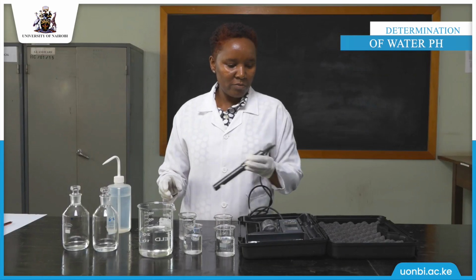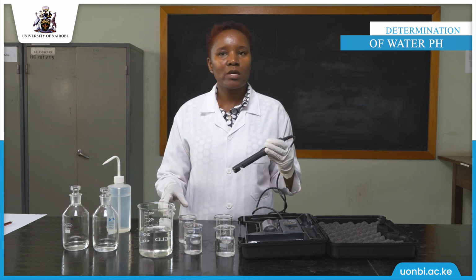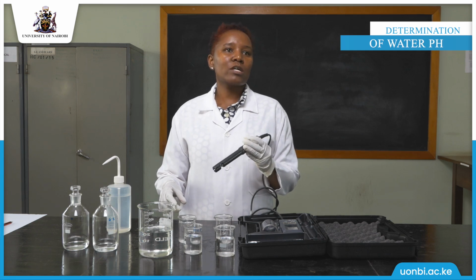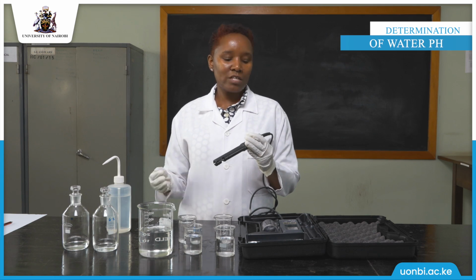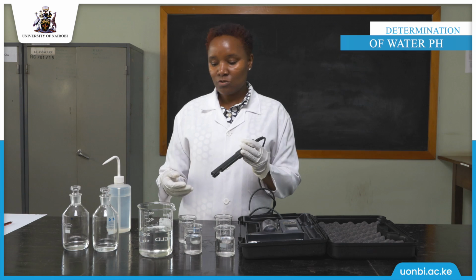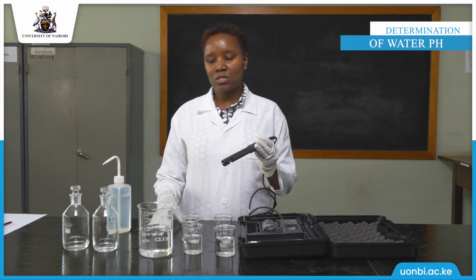The reading has already stabilized, and the pH for this water sample is 6.86. So this means this water is neither acidic nor basic. It is tending to neutrality. So this is actually water that is recommended. It can be used as a domestic water source.